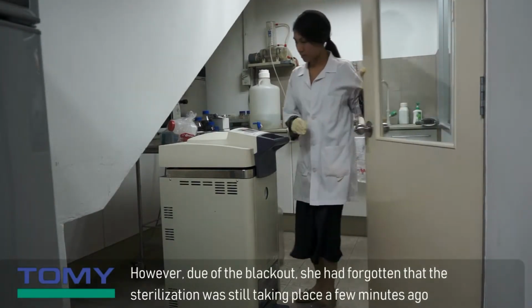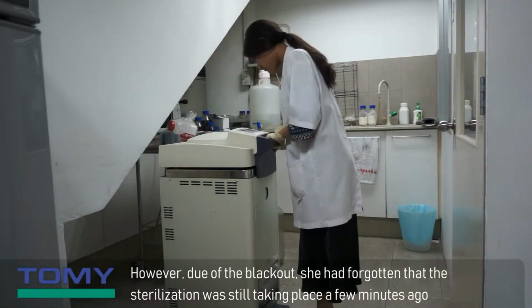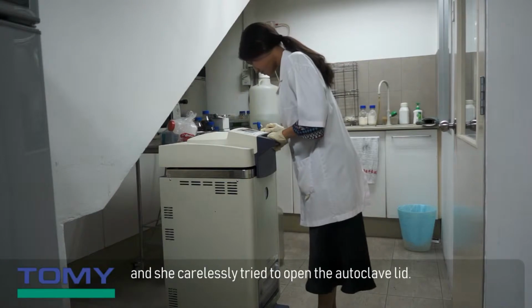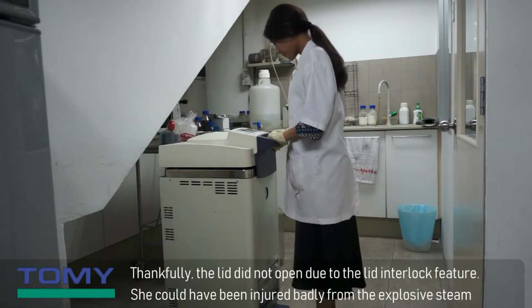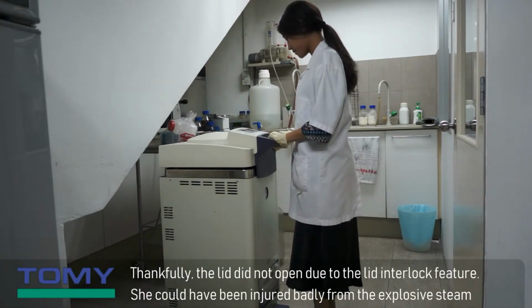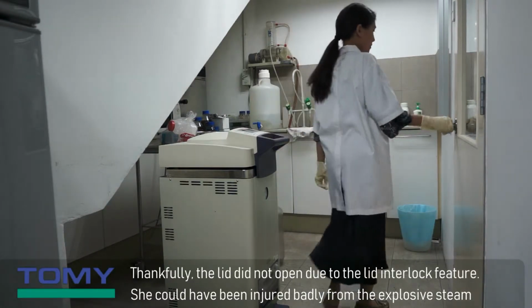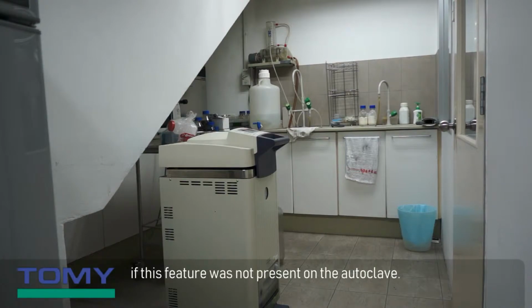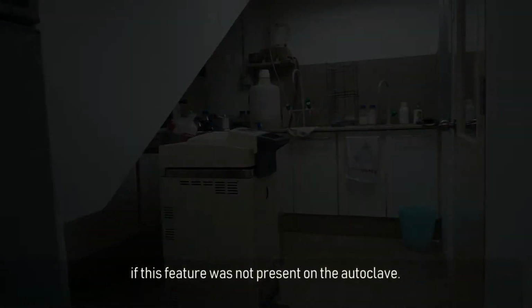However, due to the blackout, she had forgotten that the sterilization was still taking place a few minutes ago and she carelessly tried to open the autoclave lid. Thankfully, the lid did not open due to the lid interlock feature. She could have been injured badly from the explosive steam if this feature was not present on the autoclave.